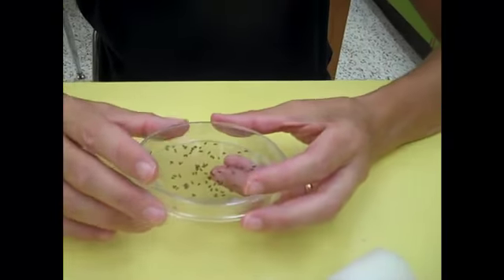Now, as far as this, if we wanted to look at these flies just to study them, to learn to tell sexes or whatever we might want to do, you can put these under a dissecting microscope using your paintbrush, move them around as you need.